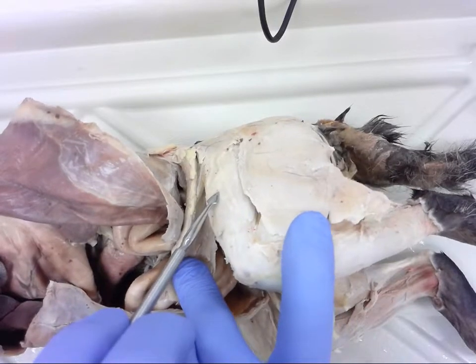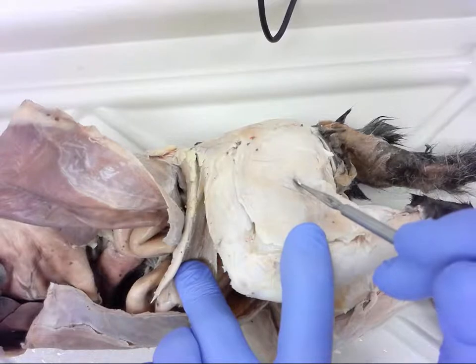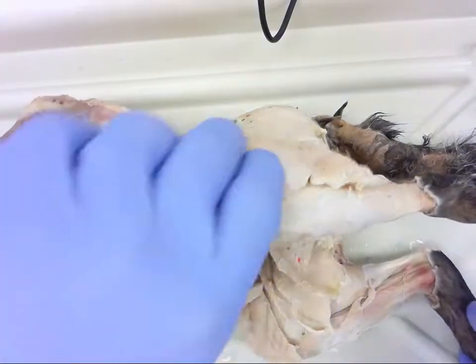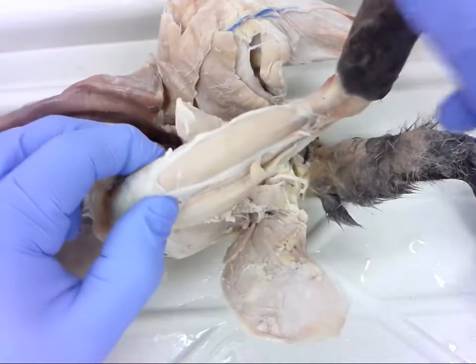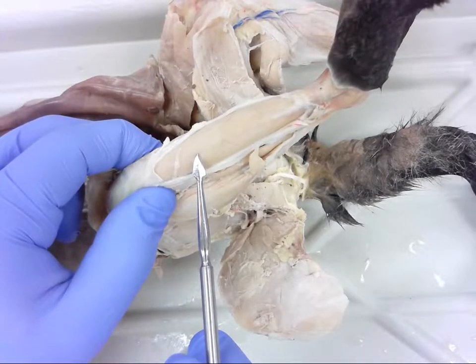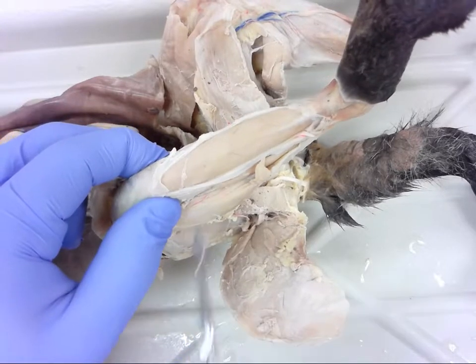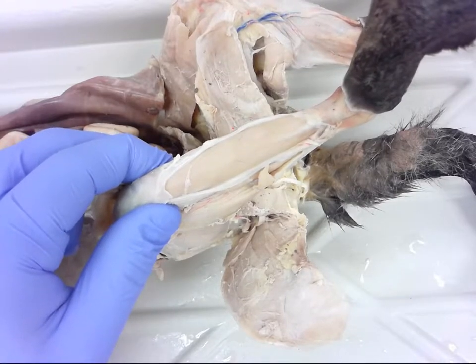Move down to number nine, and then shift back over to number ten. Feel free to fast forward or rewind for any of those numbers, take a closer look, and then you can refer to the description for the answers. Hope you did well.